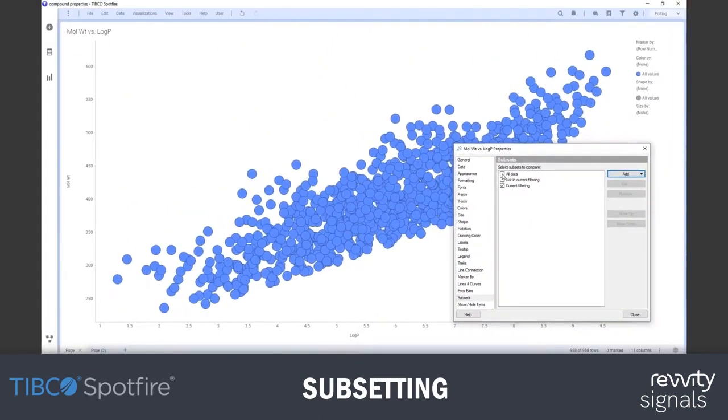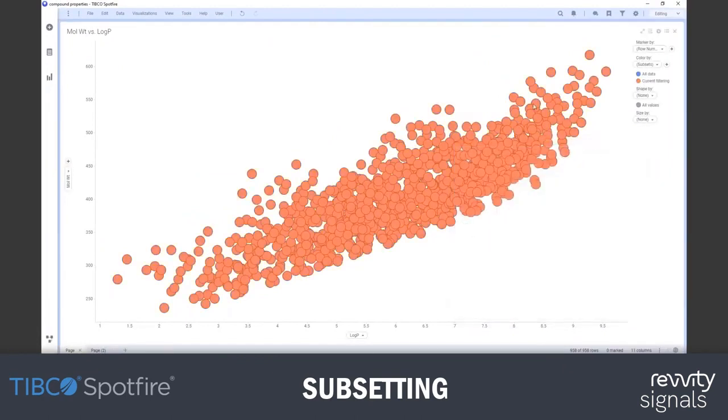I'll turn on another slice of data in this visual, which is called all data. Once you turn on subsets, you have to use them somewhere. So here I'm coloring by what the two different subsets are. The current filtering is red, all data is blue. I'm going to change that to a light gray for all data, and the current filtering is red. It's not showing up right now because the current filtering shows all the data, and that has the very same shape and structure and content as the all data slice of the data set.